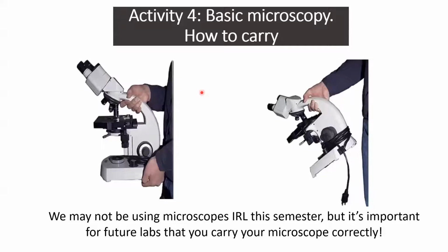So if we were in lab, you would have to know how to properly carry your microscope. So basically, this is a no-no. You want to carry it from the arm as well as the base.